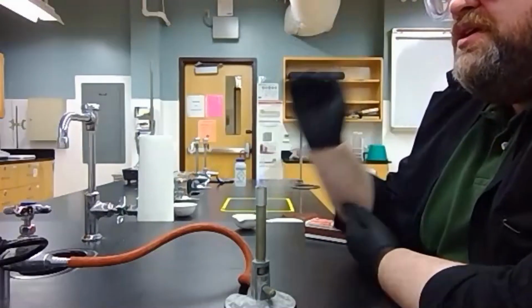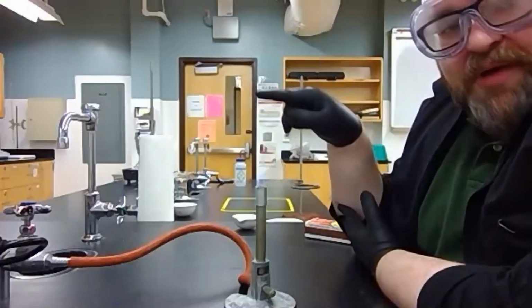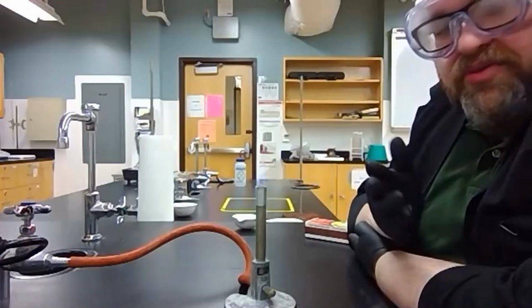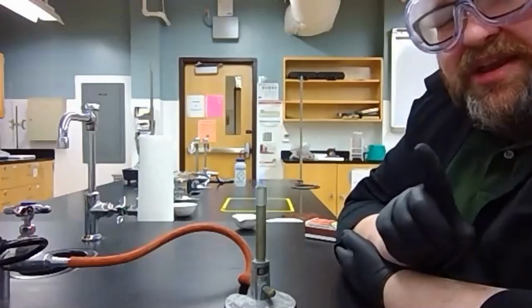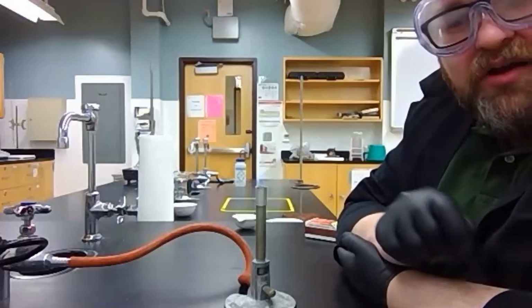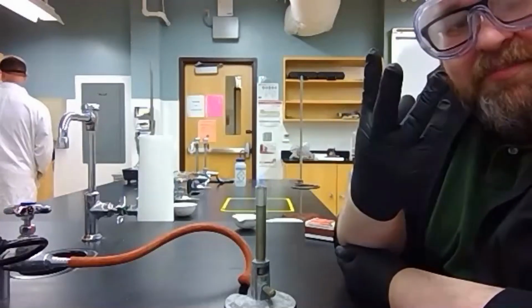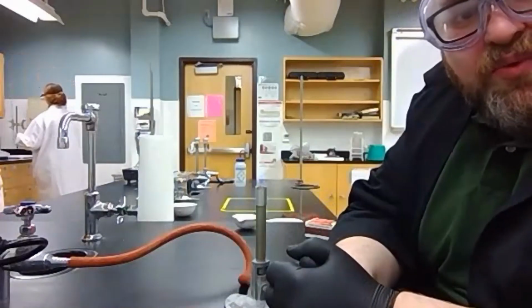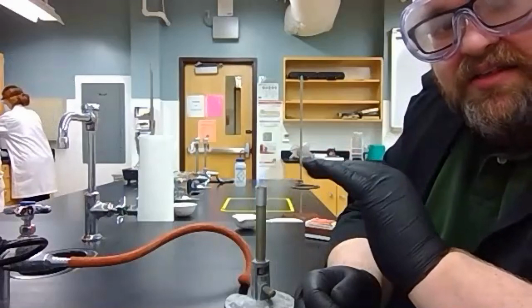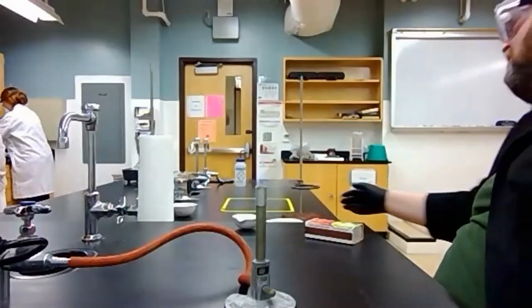So what we're going to do is we're going to put our evaporating dish a little bit above the outer blue cone. That's going to be more than hot enough to boil our water. The other thing is we need to gently heat our water. We don't want popping and fizzing, because every time a bubble pops, some of the salt gets thrown out of our solution. So we need to do this as gently as possible. Okay? So now I'm ready to set up the rest of my setup.